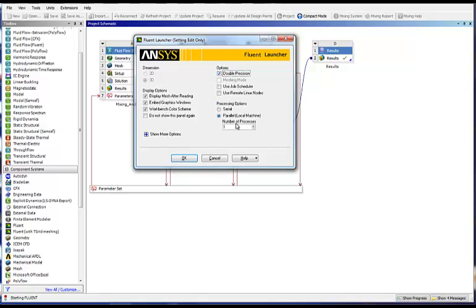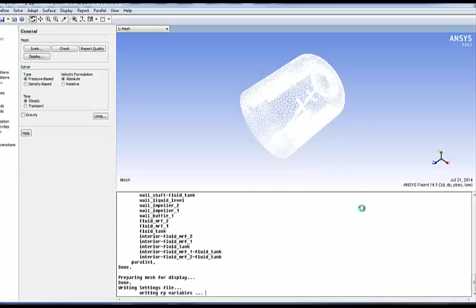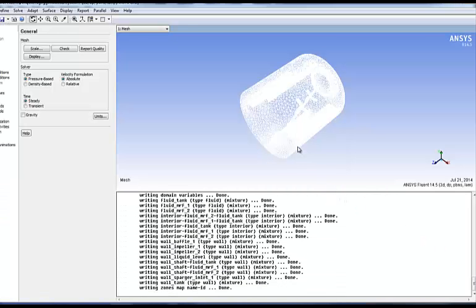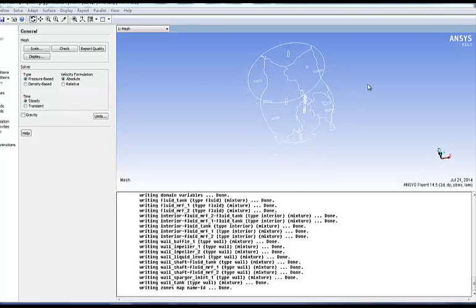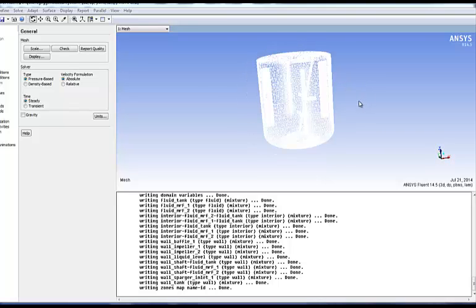I'm going to use double precision, I'm going to use four processors for this simulation, and you will see that as Fluent opens, the mesh from our geometry is directly imported. Thank you very much for your attention and I hope you found this tech tip useful.